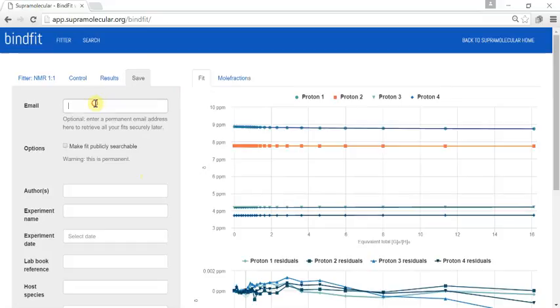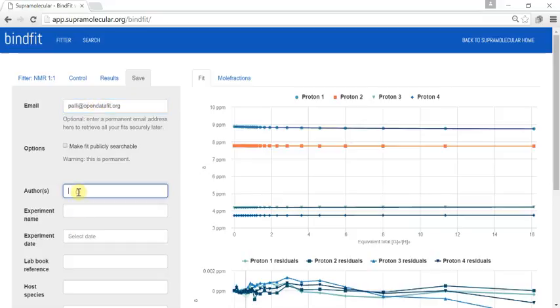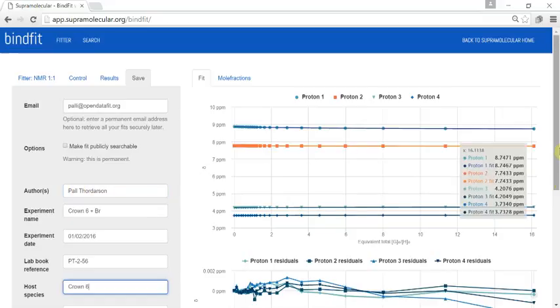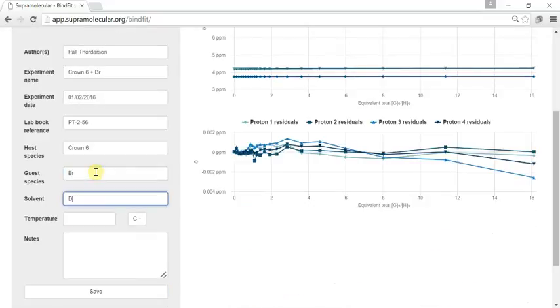You can then go on to save your data, and if you associate it with an email address you will be able to retrieve that data very easily later on. You can add any other metadata such as the experimental name, host and guest species, and so on.